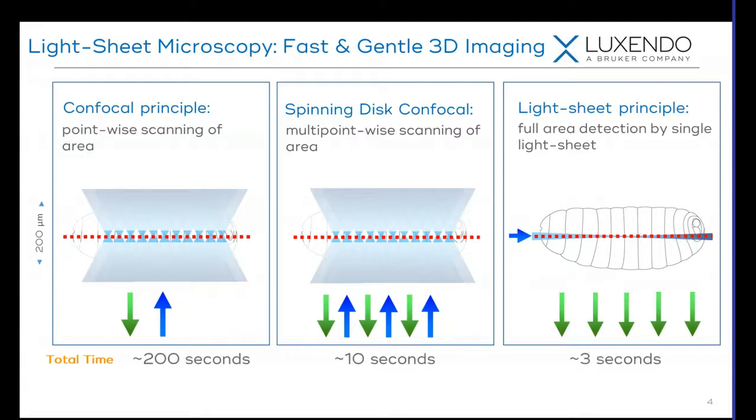First of all, speed. So if we're trying to image the embryo, the total imaging time for a light sheet is significantly faster than a laser scanner or a spinning disk. This is in part due to the illumination scheme. Because we have essentially a wide field based illumination, that is, there's no confocal aperture downstream, we can use a much lower laser light and detect with much higher signal to noise than we can in laser scanner or spinning disk.